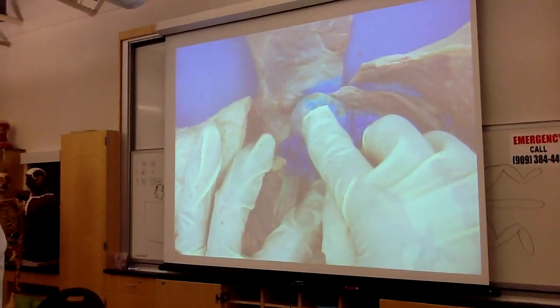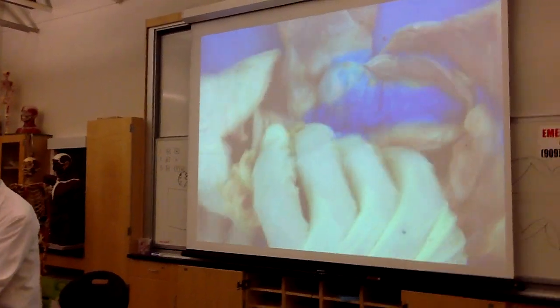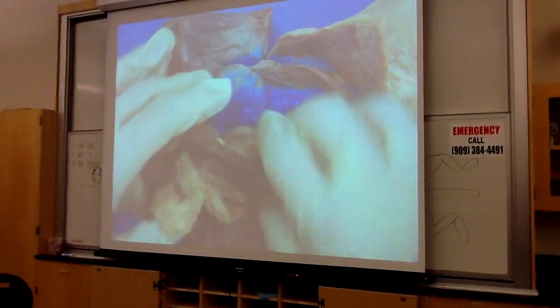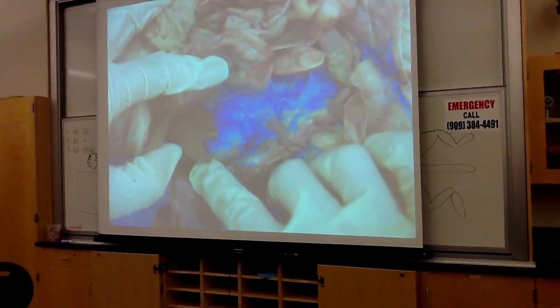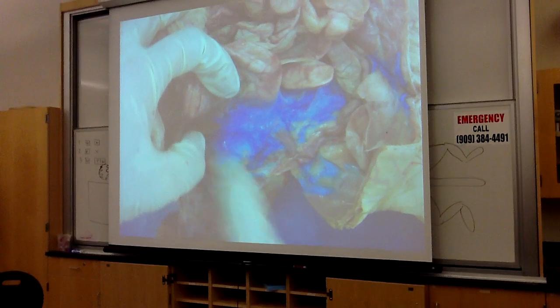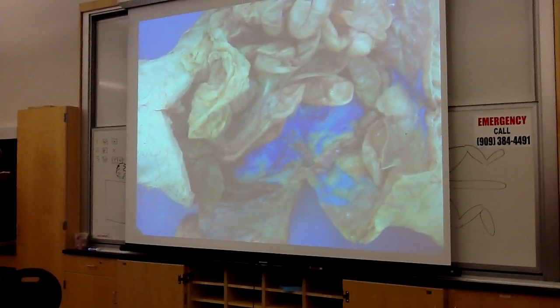That is the left kidney of the cat. And that's typical. Notice it doesn't fall if you're standing up, because it's shrink-wrapped to the back of the body, right there. So there's a left kidney here, and then if I take everything and push it the other way, you'll see right here the right kidney. And the right kidney is always cradled by one of those extra lobes of the liver right here. So it's a little more covered. But make sure you can find your two kidneys.